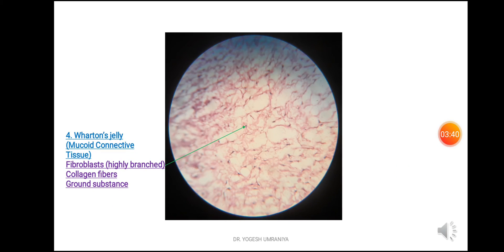In this microscopic field you can have a closer look at Wharton's jelly, or the mucoid connective tissue found within the umbilical cord. The green arrow is pointed at the highly branched fibroblast cells. Apart from the fibroblasts, you can also see the collagen fibres as well as the ground substance.